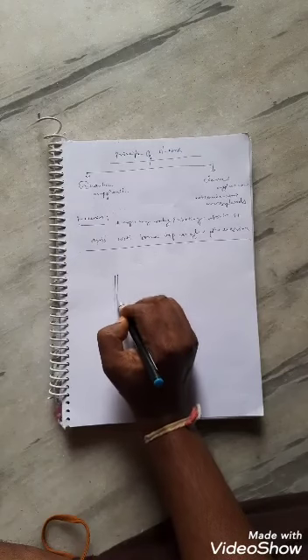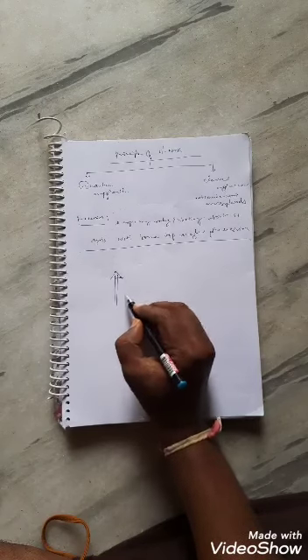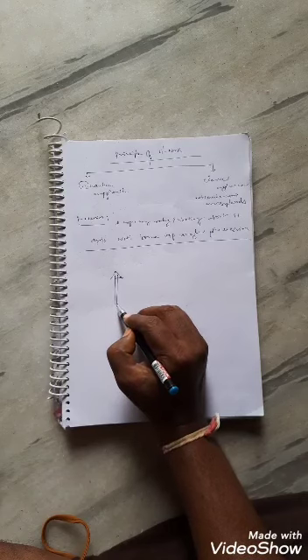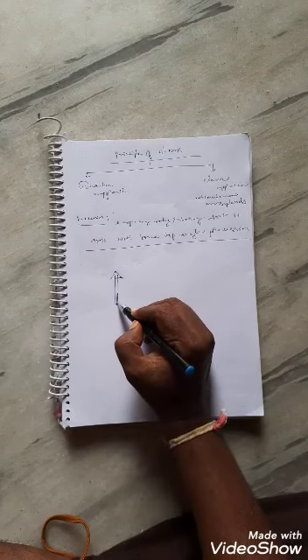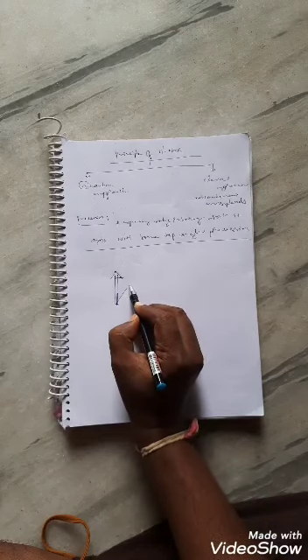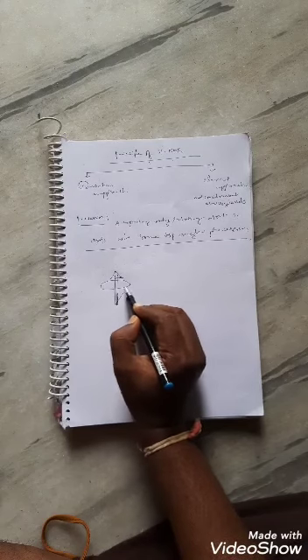Right. So let us suppose this is the spinning body, and this spinning body, under the influence of an external force or external magnetic field, is moving like this, right?